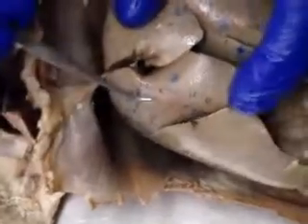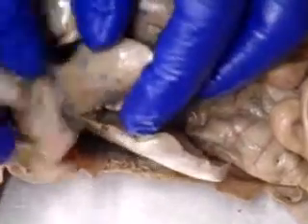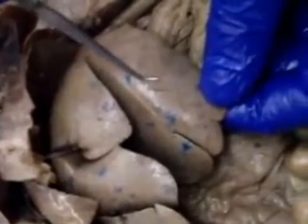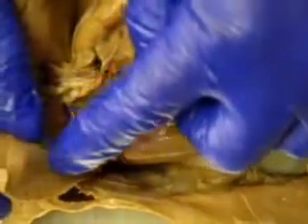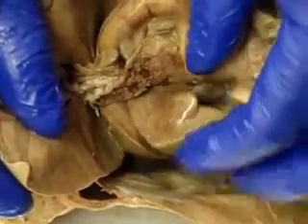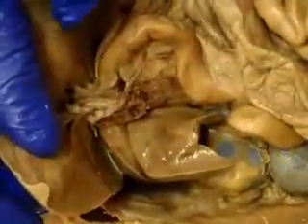So this is the right medial lobe of the liver, and we know that because it goes around the gallbladder here. Now the falciform ligament, once again, separates the right medial lobe of the liver from the left medial lobe of the liver. And then here is the left lateral lobe of the liver. Now if we follow the liver down here, we're seeing two more lobes, one right there and one right there. This is still the right medial lobe, so this small one right here is the right lateral lobe, and then the one that I have my other finger on right here is called the caudate lobe. So those are the lobes of the liver there.